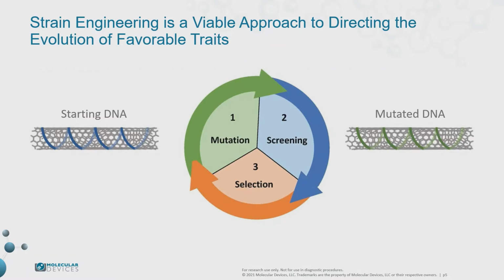Currently, directed evolution using genetic engineering methods and protein design using computer technology are the two most common methods of enzyme engineering. While this is a valuable approach to food and fuel sustainability while making efforts to combat climate change, the high throughput nature of this process possesses major challenges and bottlenecks when screening and selecting tens of thousands of mutants a day while also managing large libraries of DNA.